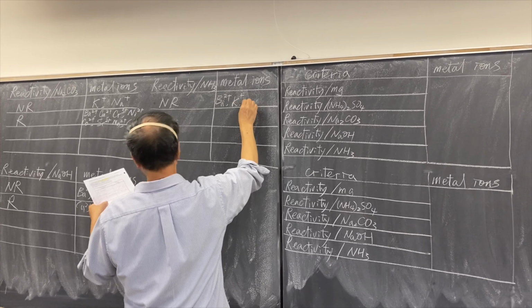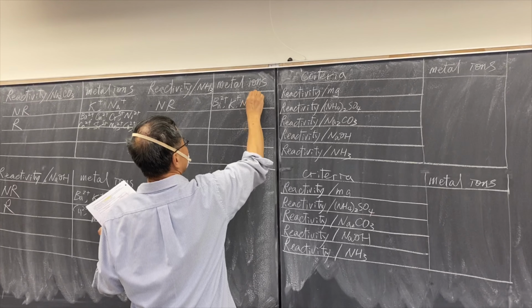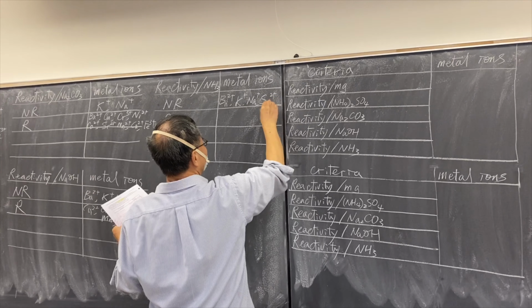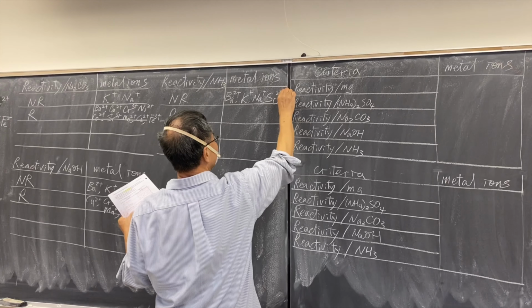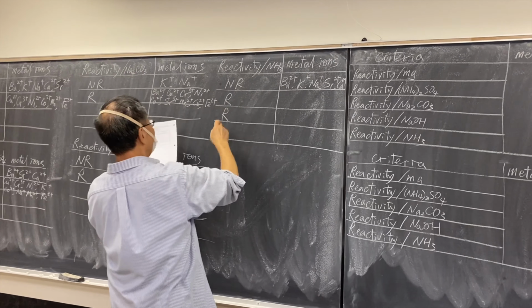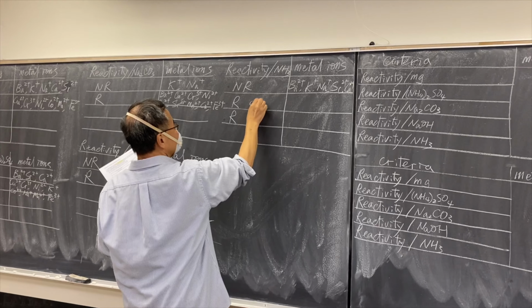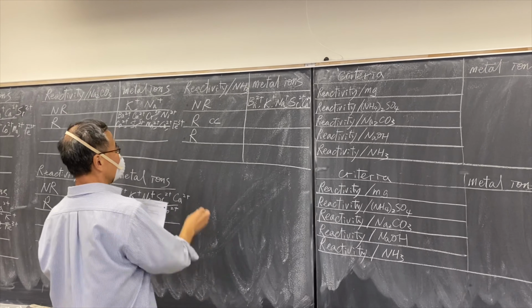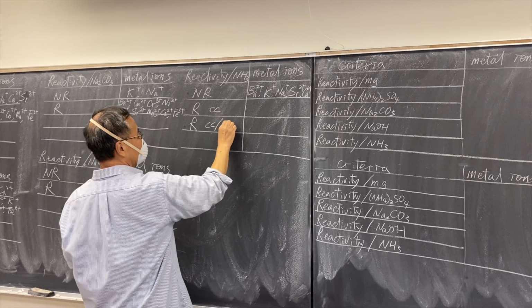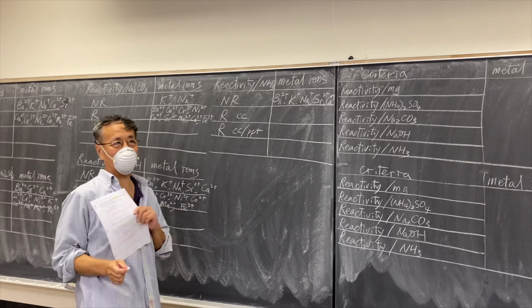And then we have the last one, which will be the calcium ion. Okay, the reaction, first one says color change only, so we have a color change only. Second, not only color changed, but also a precipitate was formed.